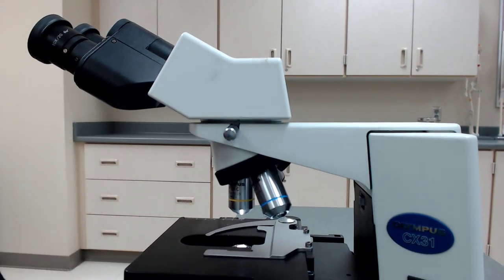So some oculars get 20x or 25x. So technically, there are microscopes like this that can get to 2,500x. But generally speaking, most microscopes try to shoot for that 1,000x area.